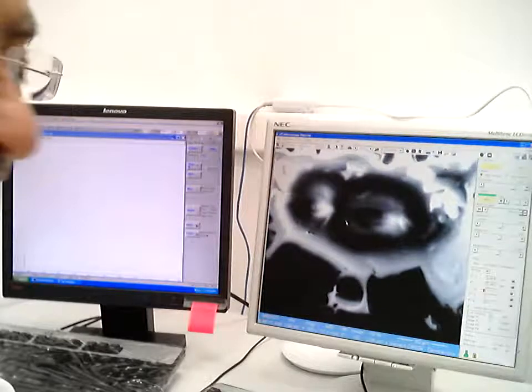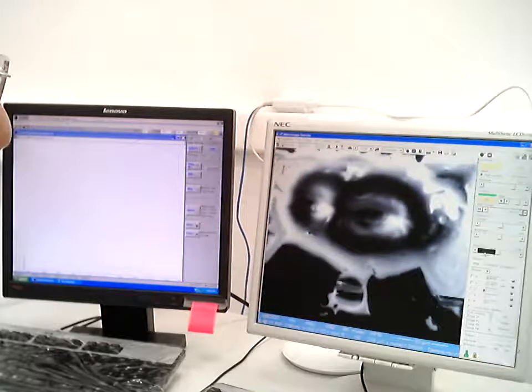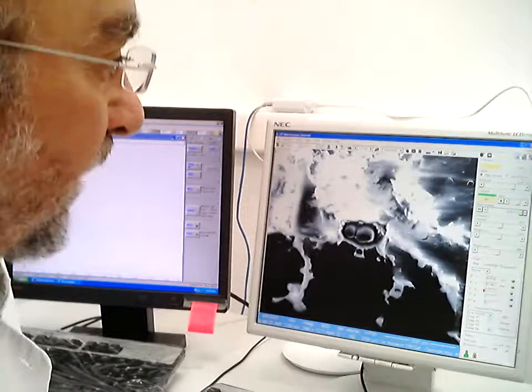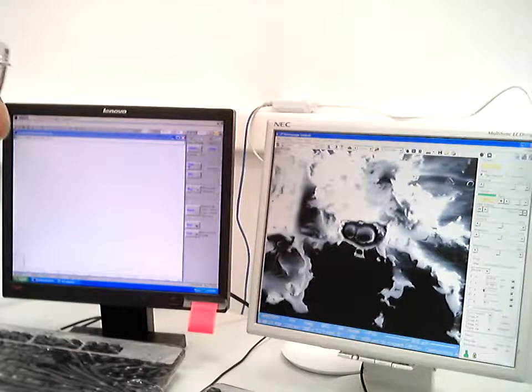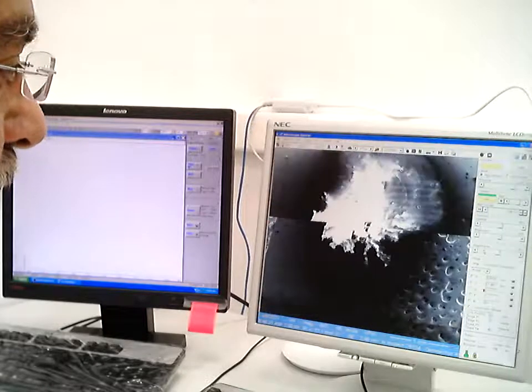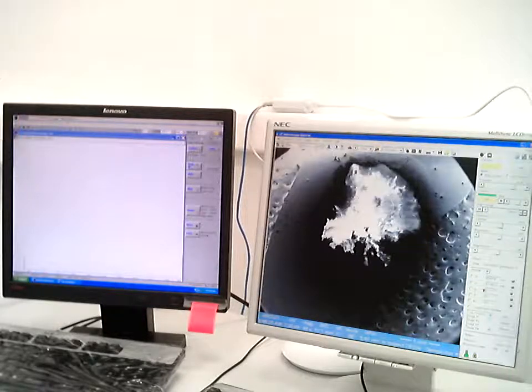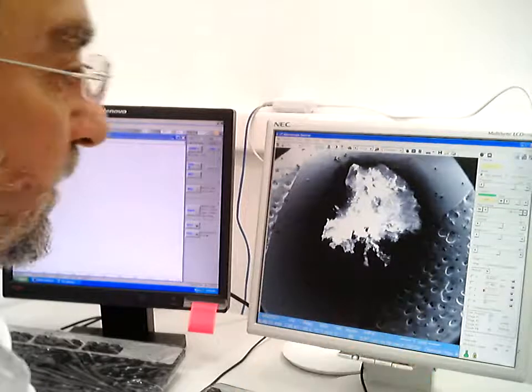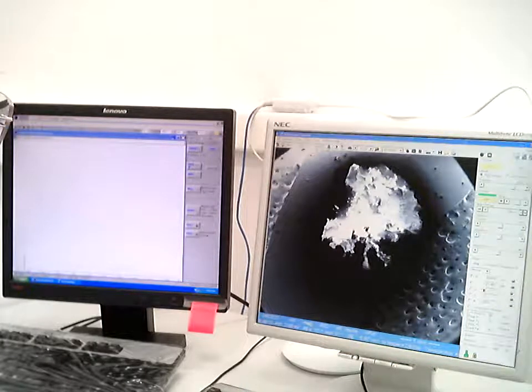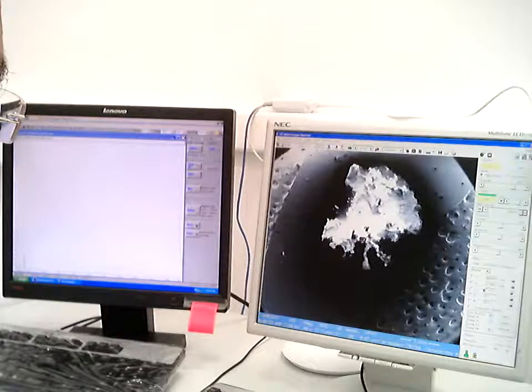And the shape of the blood corpuscles can actually give us information, and when we analyze them, it can give us information whether it's an animal or a human blood or things like that. This was on a piece of glass, and so it could have been a piece of glass that broke during a fight or during somebody breaking in and things like that. So there's the glass over here. On the glass, there's also particles. Let's see if we can identify any of these particles.